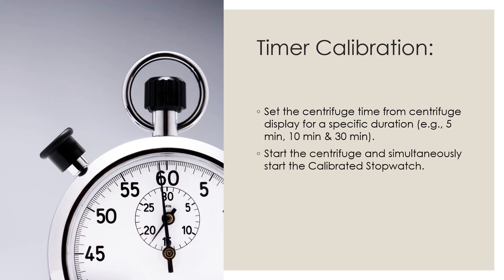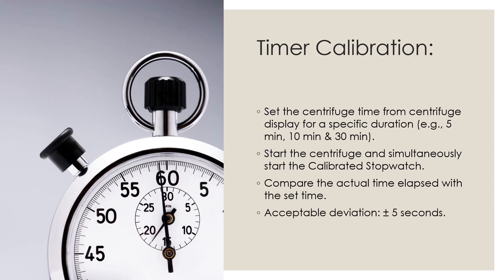Start the centrifuge and simultaneously start a calibrated stopwatch. Once you start the centrifuge as per the set time, start the stopwatch at the same time. Then compare the actual time elapsed with the set time — compare the stopwatch reading with the centrifuge time and calculate the difference. The acceptance criteria should be within plus or minus 5 seconds.